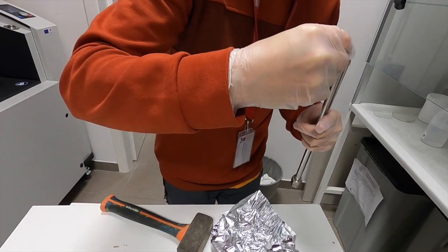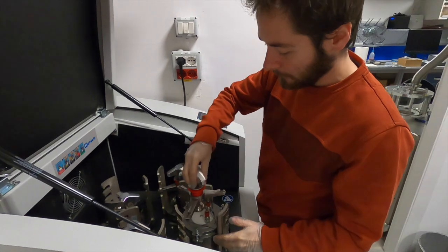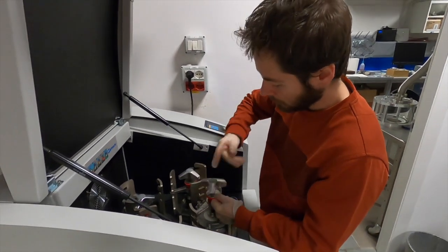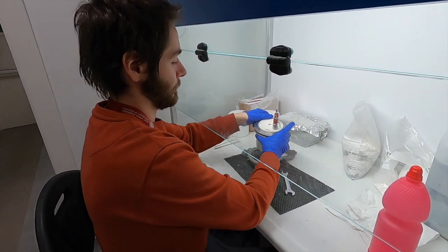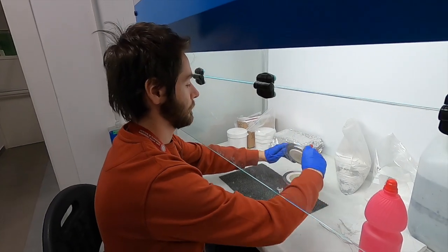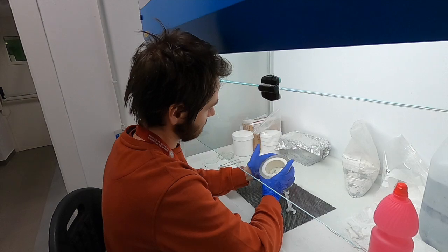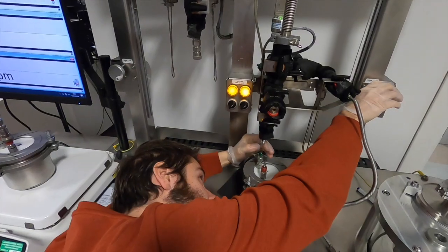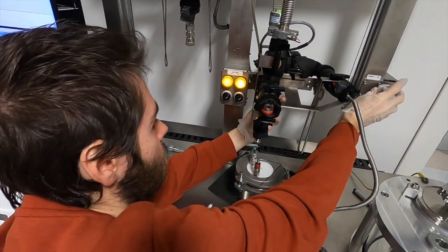Part of my job is done in the field, where we collect rock samples to study. And then the second part of my job is in the lab, where I spend most of the time to characterize the rocks we collected at the optical microscope, looking for fluid inclusions, and then after this to extract these fluids mechanically through protocols that we developed here in the lab. After this extraction process, we can then analyze the chemical composition of the gases and, for instance, identify methane or hydrogen trapped.